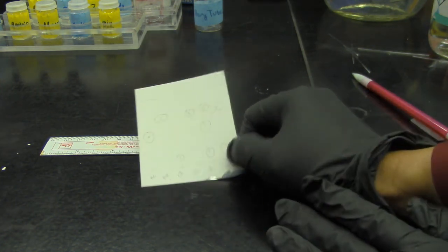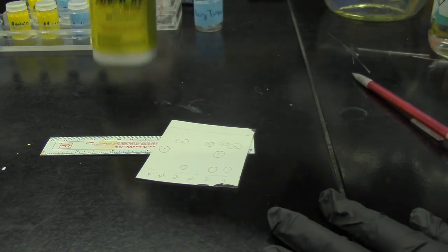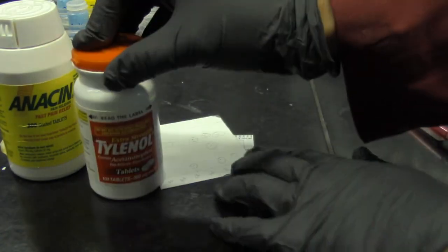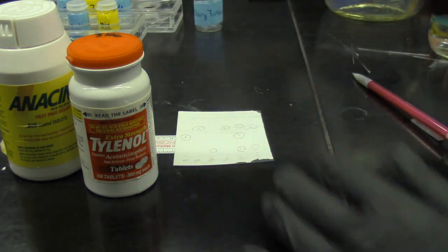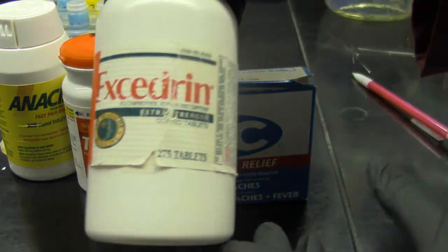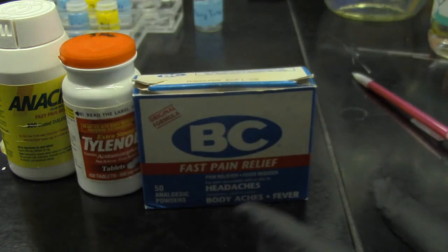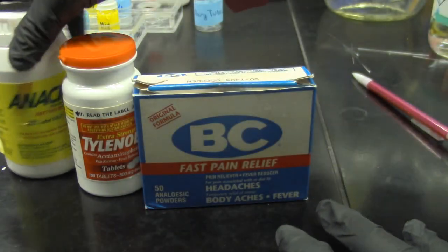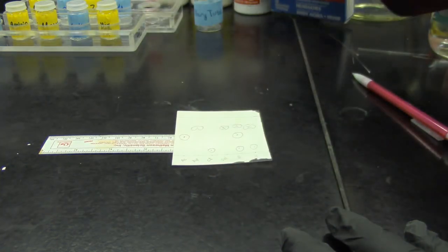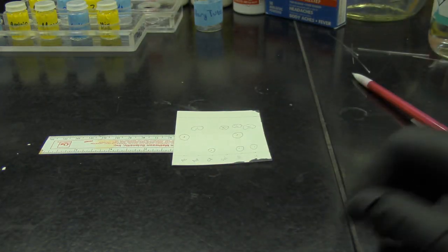So the unknown can be from aspirin, it can be from Tylenol or BC tablet, right? Or it can be Excedrin, right? So one of these your instructor is going to assign to you, so you can determine that from a TLC plate.